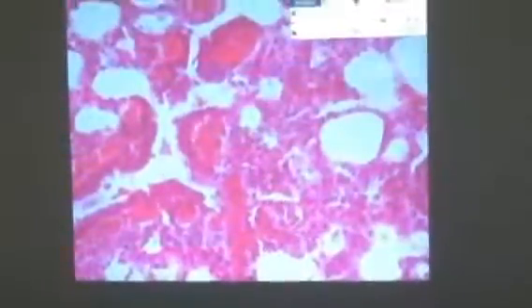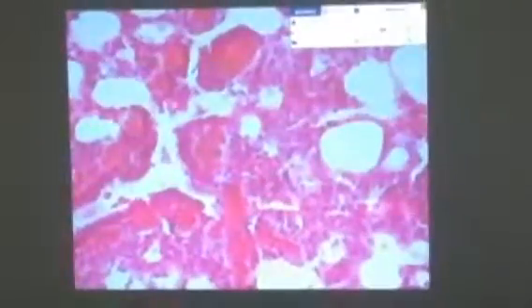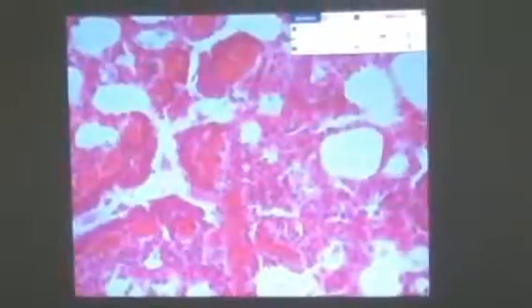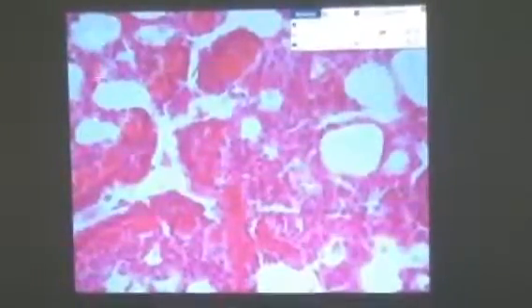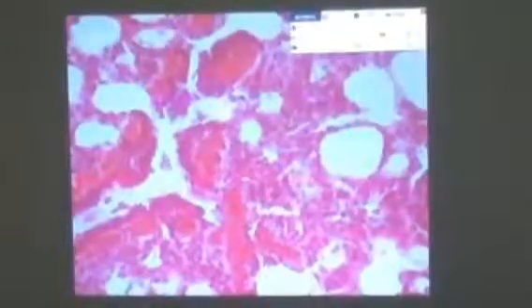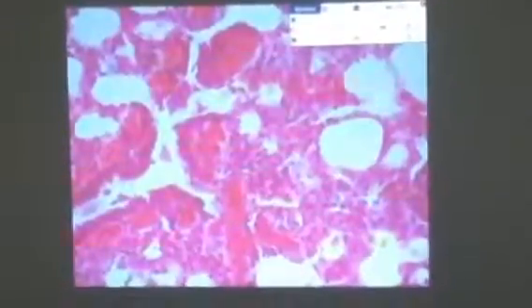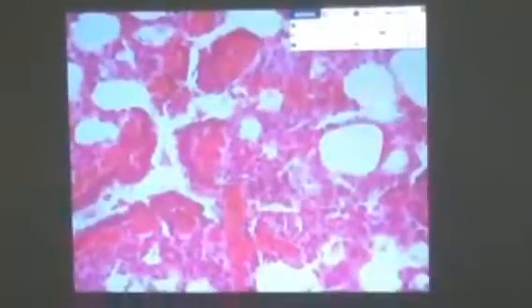Respiratory bronchioles. Now, they are called respiratory bronchioles because the interruptions are actually attachments of the alveolar sacs to the wall of the respiratory bronchiole. That is why at this level of the respiratory tract, there is gas exchange between the inspired air and the blood, because of the presence of the alveolar sacs in the wall of the respiratory bronchiole. That's the name, respiratory bronchiole.